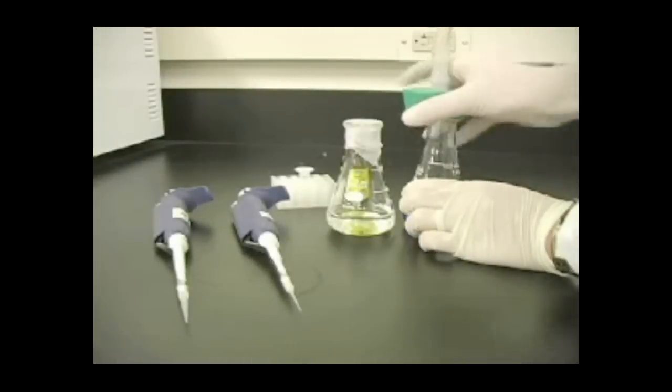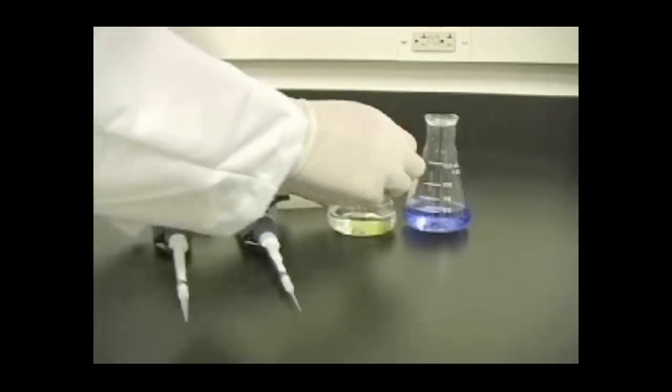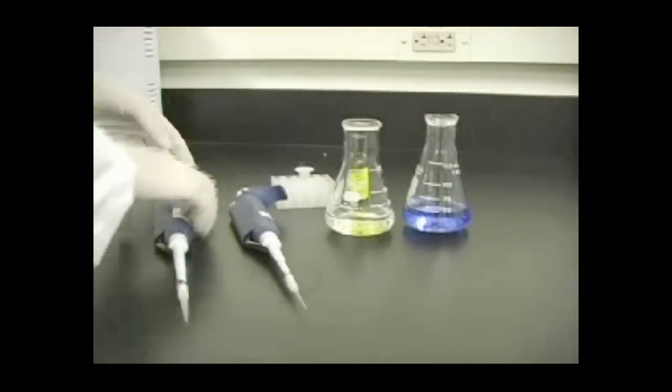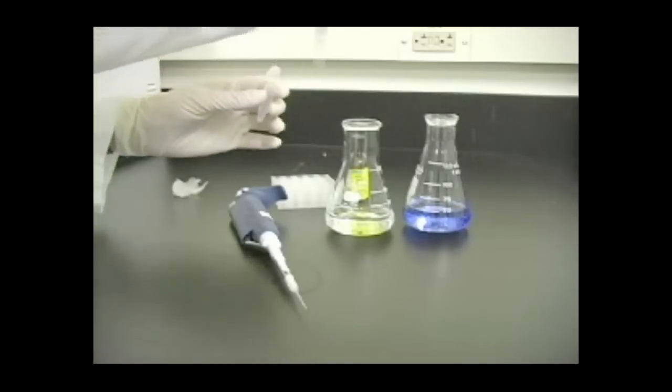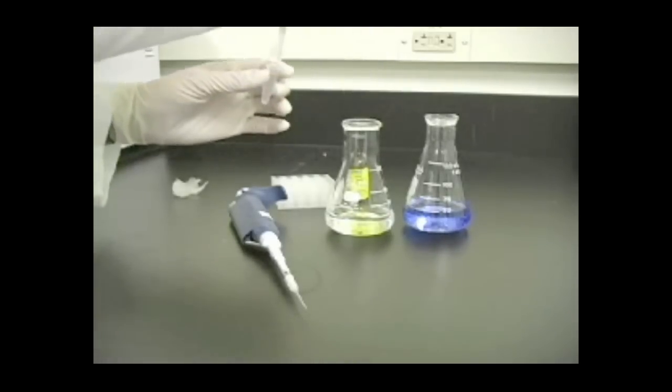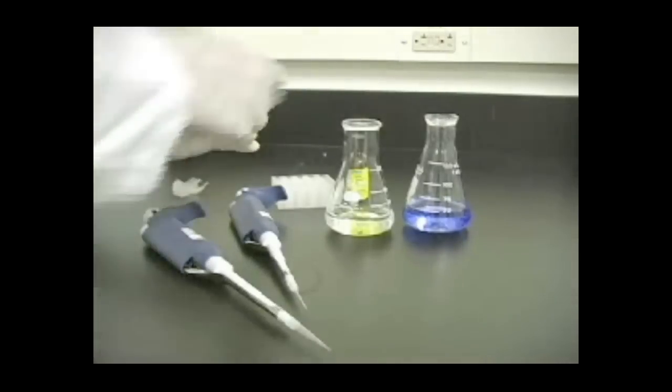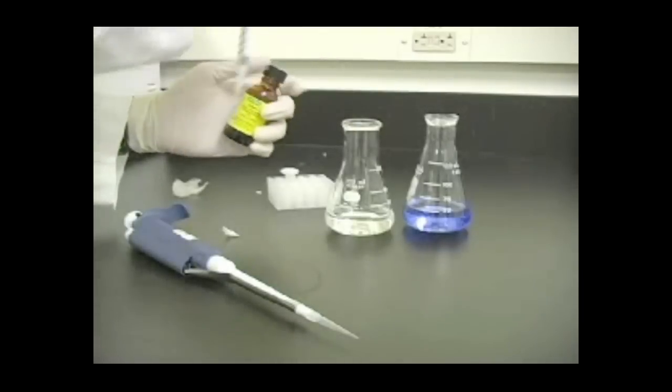Add APS and TEMED to your degassed light and heavy monomer solutions at this point. Monomer solutions should be made according to the gradient gel percentages desired and amount of solution required. Please see your manual for detailed recipes. In this video, we have artificially colored the heavy solution blue so that you will be able to see the gradient forming. Be aware that your heavy solution should not be blue.